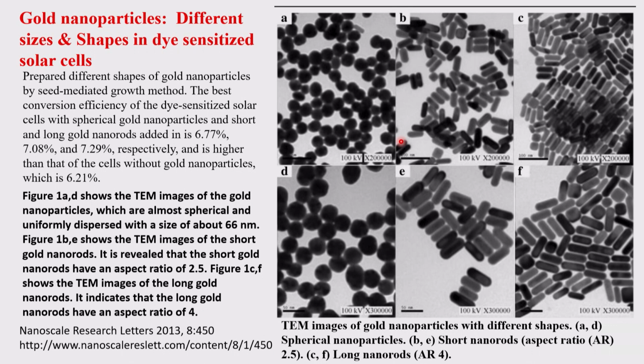Of course, the ultimate goal of this particular paper from where I took is that they were trying to compare the efficiency of the solar conversion, the light conversion to energy. That's what is called basically solar. The light is from the solar, so therefore solar. So these are used in the solar cells to convert the light energy into the working energy, electrical energy, any of those kind of thing. This conversion efficiency is the one which is top. So by materials on their own, by materials which are impregnated with something, or by materials which are coated with something else, that is what basically the application field in this, and they are all nanomaterials.